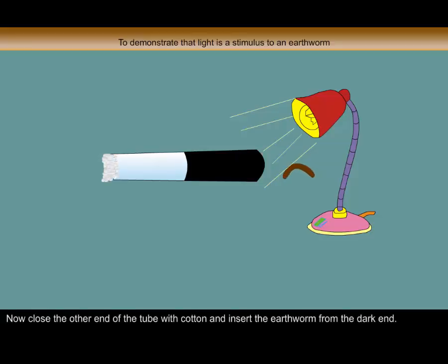Now close the other end of the tube with cotton and insert the earthworm from the dark end. You will observe that the earthworm remains in the dark portion of the glass tube.